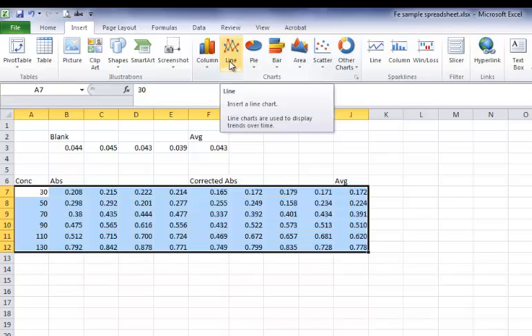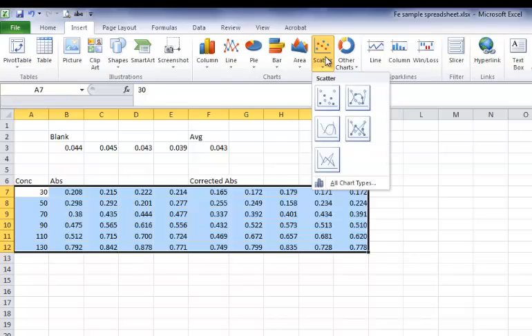It makes all of your X points evenly spaced regardless of their value. The X numbers are just treated as labels. They are not actually treated as numbers. So what you want is a scatter plot, because this treats both X and Y as actual numbers.